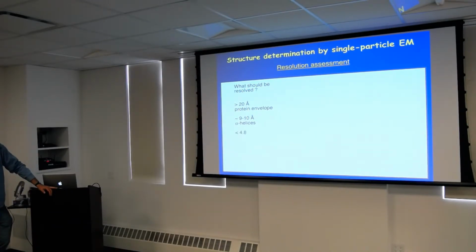No, it's correct. So 4.8 angstrom. Yeah, structures, exactly. We can see now detailed structures. What? The structures we can see hydrogen bonds more. Hydrogen bonds? No. Between side chains we cannot see hydrogen bonds. Even side chains is not that easy around 5 angstrom. So think about this one. Secondary structure element, the other one.